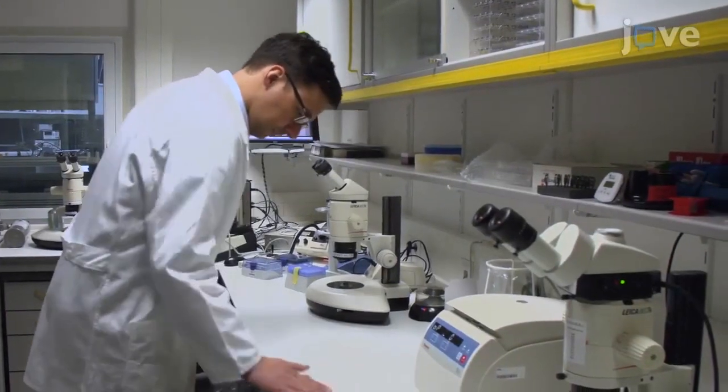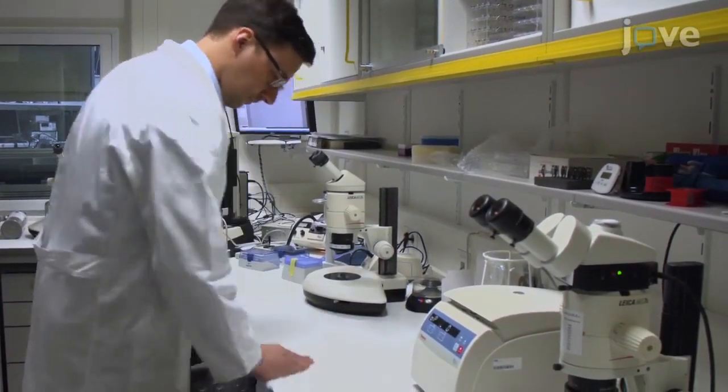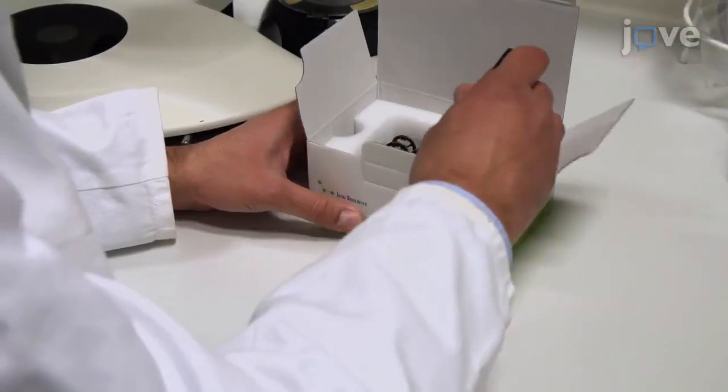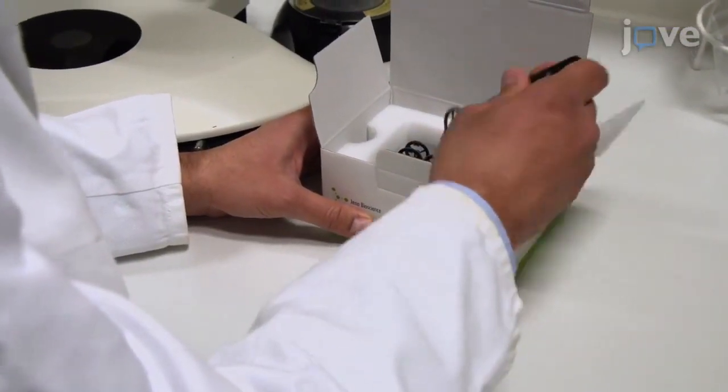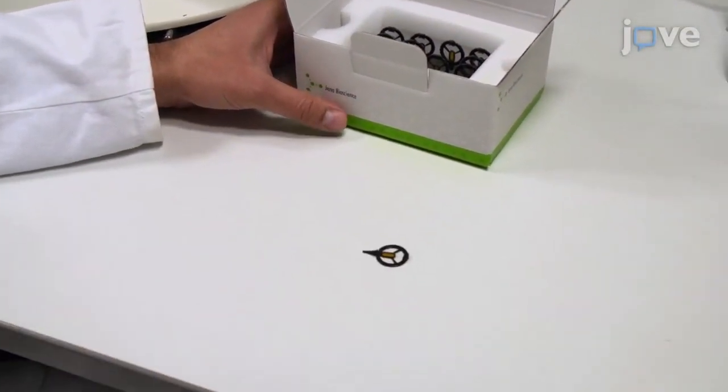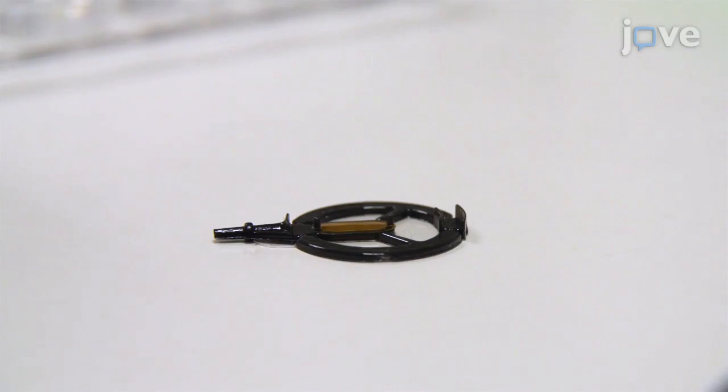To begin, create a clean and dust-free surface using a damp, lint-free cloth. Take one sample holder from its box and gently place it, yellow foil facing up, on the clean surface to avoid damage or unwanted puncture of the backside COC foil.